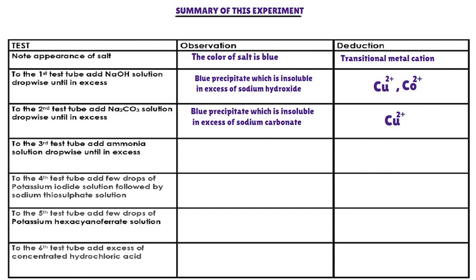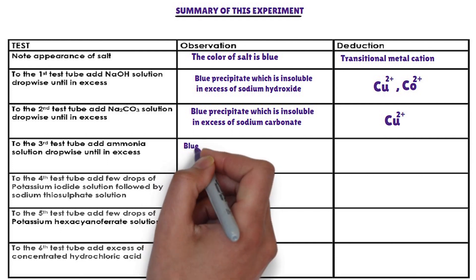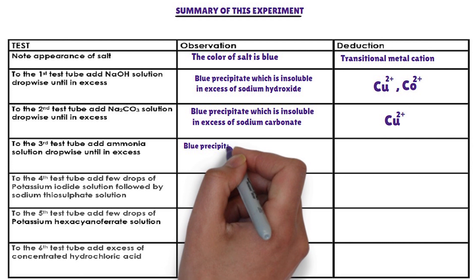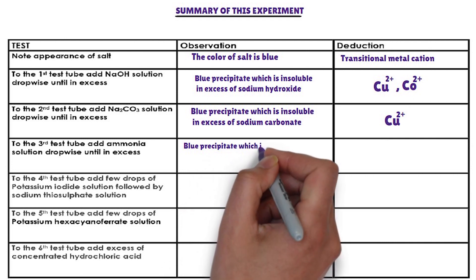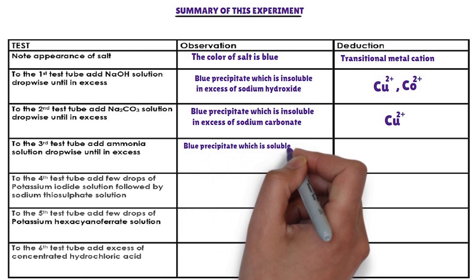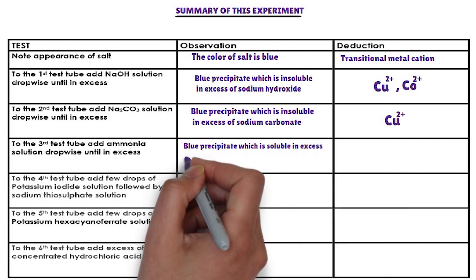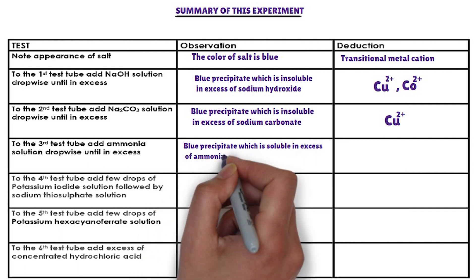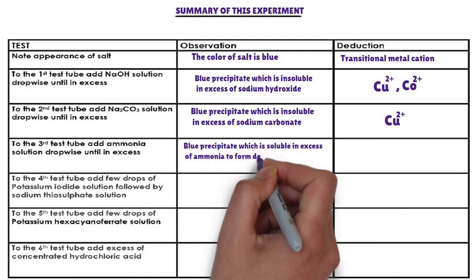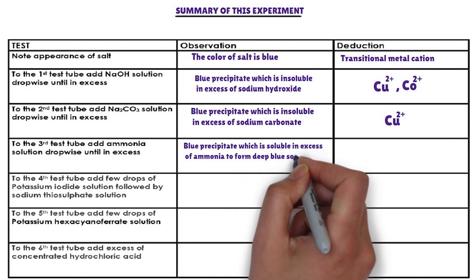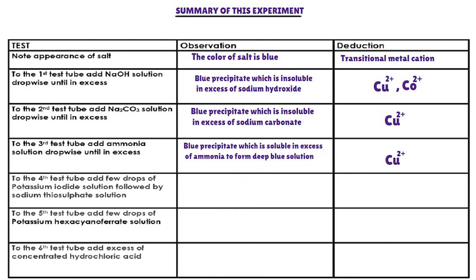Confirmatory tests. First confirmatory test: ammonia solution is added dropwise to the third test tube. The cation that forms a blue precipitate with ammonia solution, and whose precipitate is soluble in excess of ammonia to form a deep blue solution, is copper-2-ion. Copper-2-ion is confirmed. The cation present in the salt is copper-2-ion.